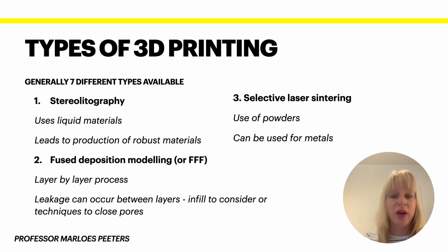Now, before going on to comparing this for a specific bioreactor, I'll have a little look at the history of 3D printing, so you can get an idea of what's been achieved in a very short span of time.